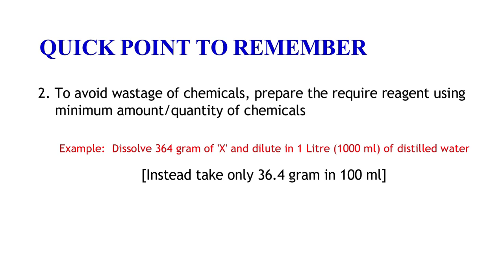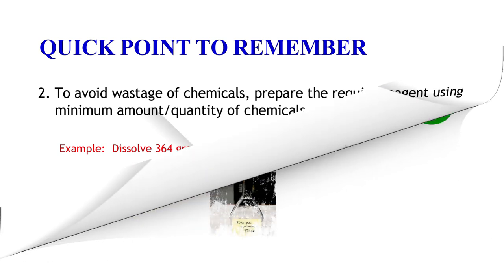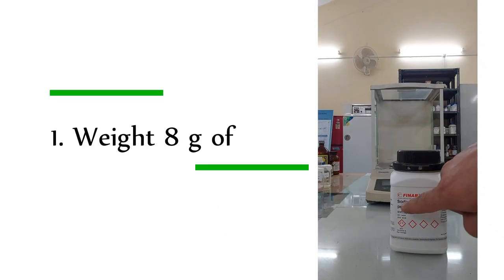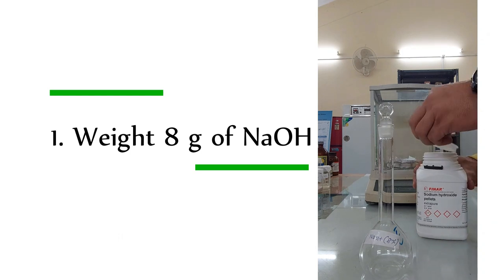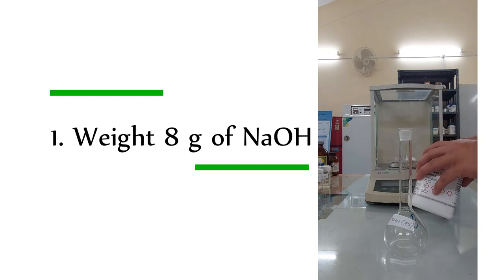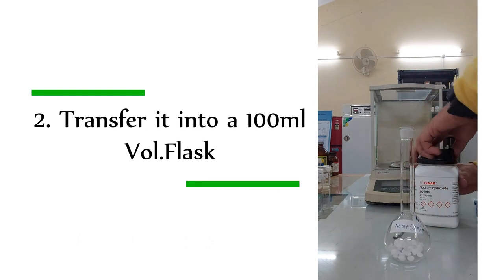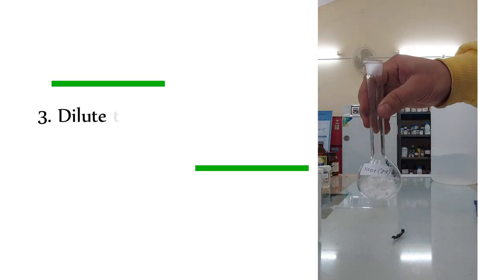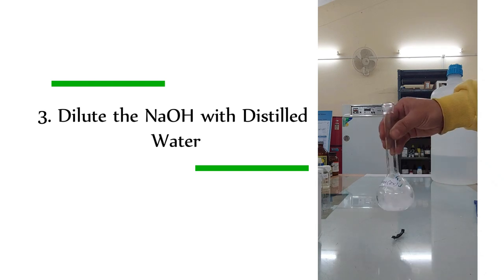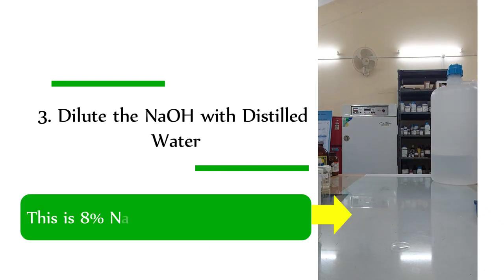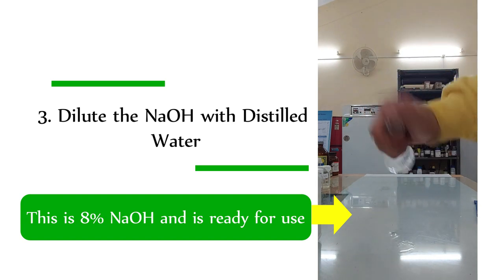Now let's prepare the first reagent: 8% sodium hydroxide solution. To do so, first weigh 8 grams of sodium hydroxide pellets, then transfer it into a 100 ml volumetric flask, and dilute it with distilled water, shaking and mixing the solution until fully dissolved. Once this is done, the reagent is ready for use.